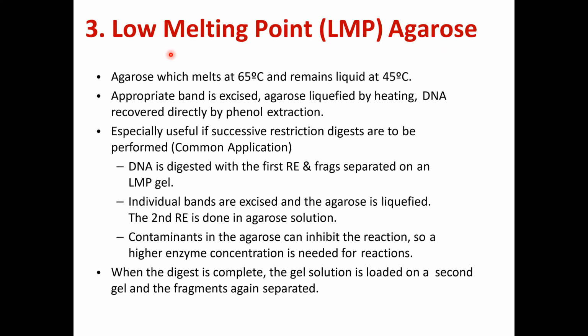So what does it mean? We are going to use 65 degrees Celsius: the agarose gel will melt at 65 degrees Celsius and remain liquid at 45 degrees Celsius. So the appropriate band is excised. The agarose is liquefied by heating and the DNA is recovered directly by adding a phenol extraction. So here we just add a phenol extraction.